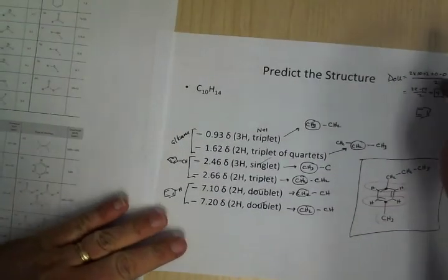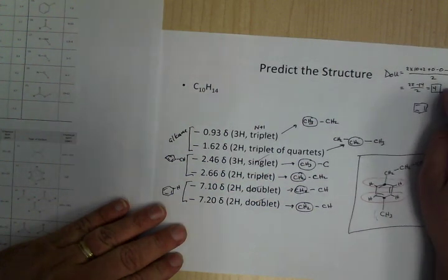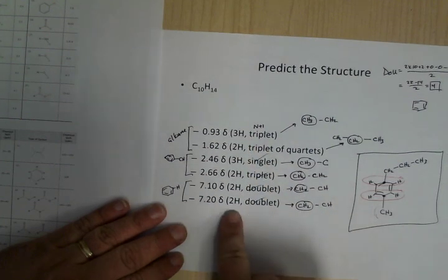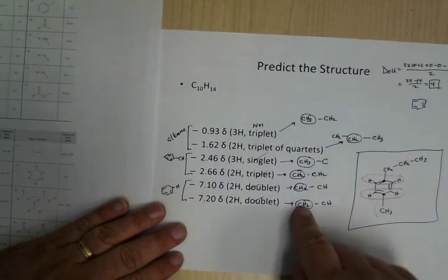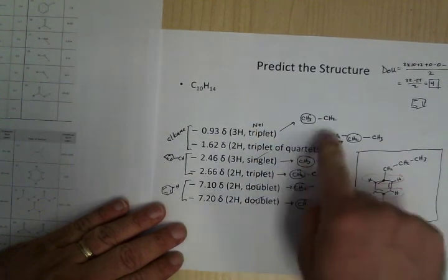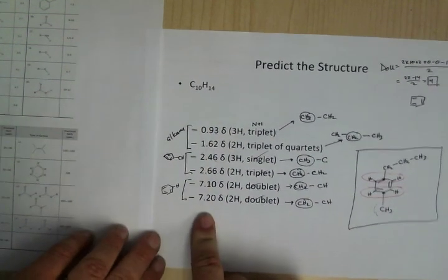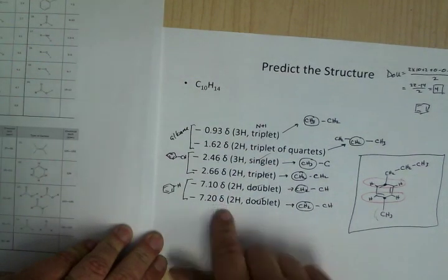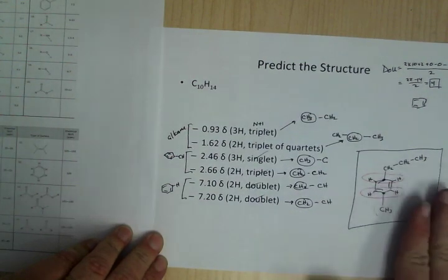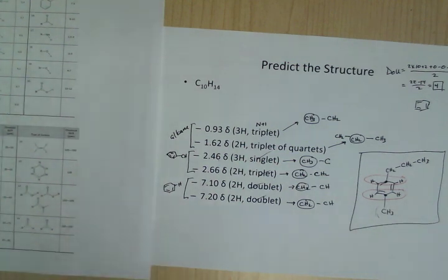Okay, so how do we do this? First thing to do is the DOU check. It's really easy information to have, and it's worth a point, so go ahead and do that. Next up, I usually check the integrations first. So we have CH3, CH2, CH3, CH2, CH2, CH2. Then do the splitting pattern, so you know what's around the environment for each one of these, and then you check the chemical shifts. Look at your chart. Look at what the chemical shifts are telling you, and then from here you can start putting the molecule together in such a way to rationalize how these things are going. So, okay, good luck.